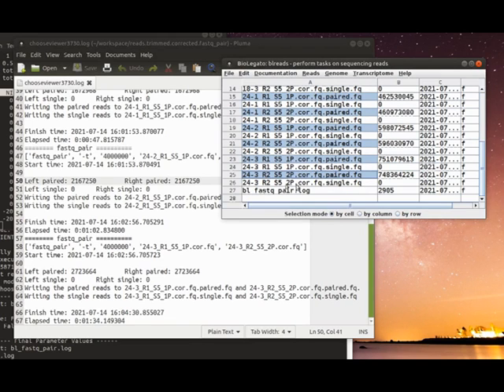So here are the same files shown in BL reads. The paired are highlighted and you can see that the single ones are 0. So this was a good result. It just shows us that we know all of the reads are properly paired. There shouldn't be any problem now moving on to the actual transcriptome assembly, which is the main point of what we want to do.